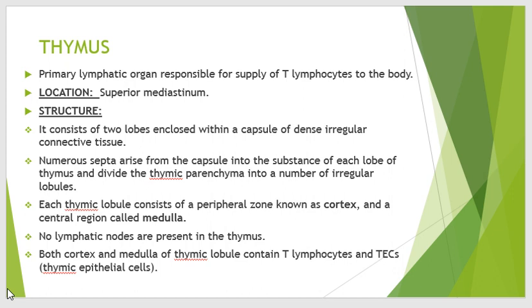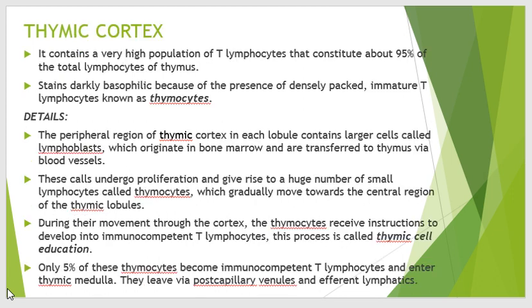Lymphatic nodes are not present in the thymus. Both the cortex and medulla of thymus contain T lymphocytes and thymic epithelial cells. First we will discuss the thymic cortex.